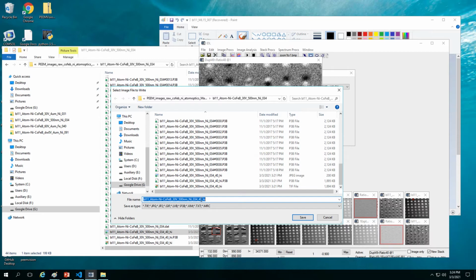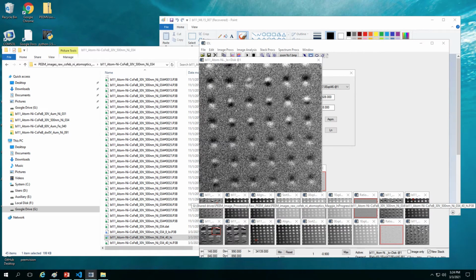This is not 4 this time, this is 8. As a matter of fact, I would think let's not put 8 and 40 here, but just write it in a document. I'm hoping we keep the prefix the same and just change low and high.